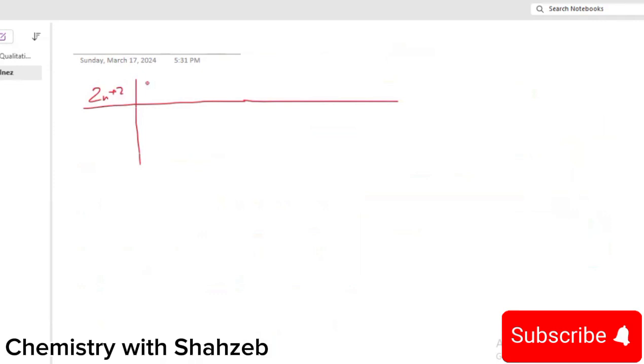What happens? There will be a white precipitate formed on addition of a small amount of sodium hydroxide. Here also a white precipitate forms. In both cases, on addition of excess sodium hydroxide, what happens?